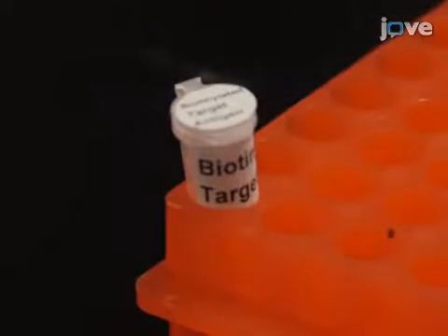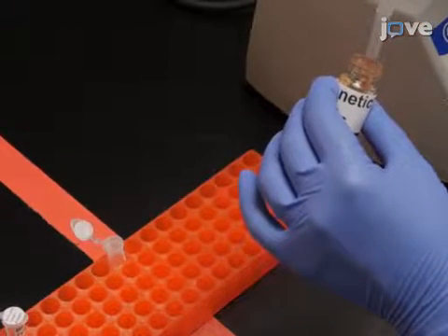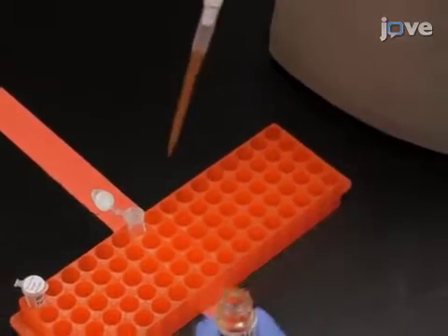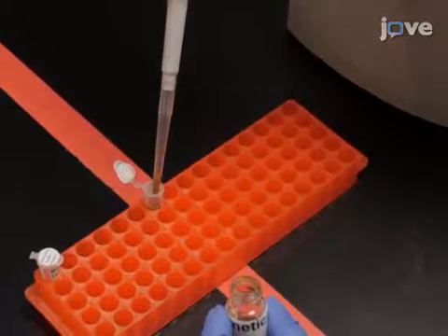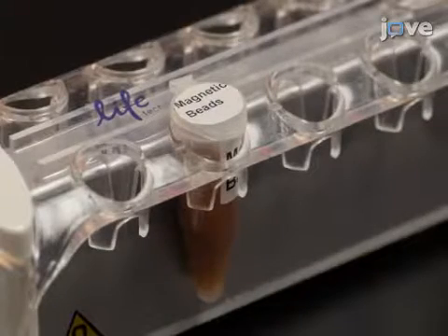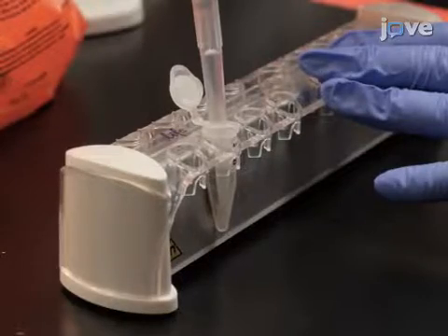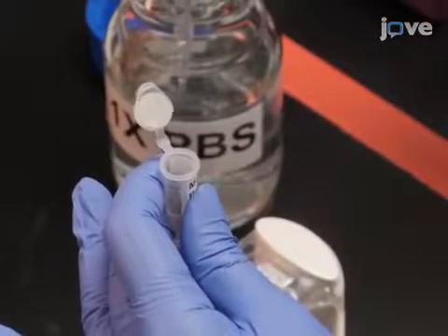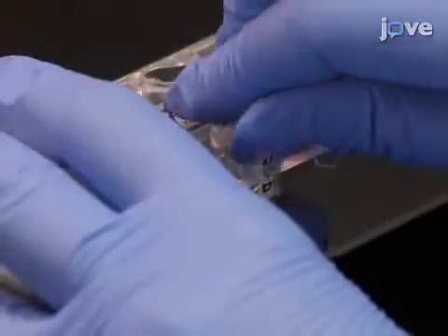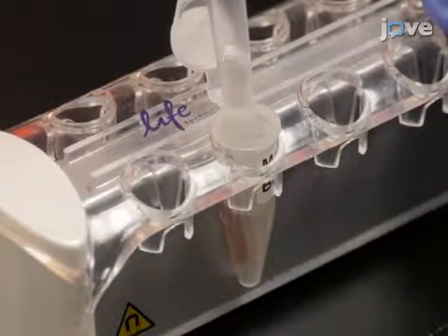After biotinylating the target antigen according to the text protocol, re-suspend streptavidin-coated magnetic beads in their original vial, then transfer 7 to 10 times 10 to the 9th beads to a 1.5 milliliter tube. Place the tube on the magnetic rack for 2 minutes to collect the beads, remove the supernatant, then re-suspend the beads in PBS without generating bubbles. Wash the beads 2 more times with PBS.